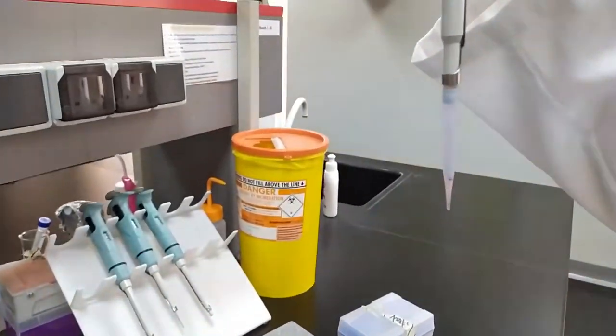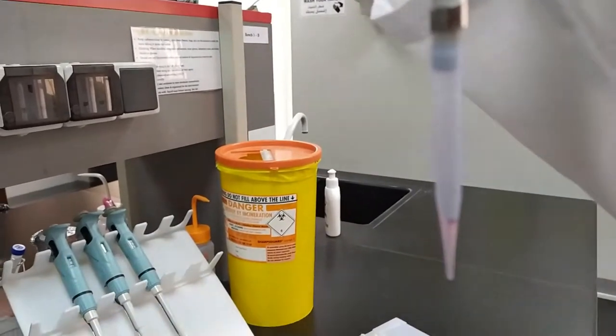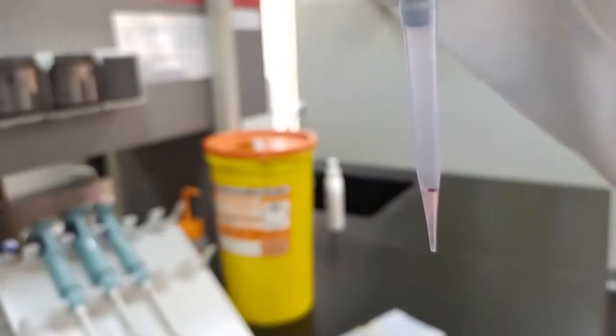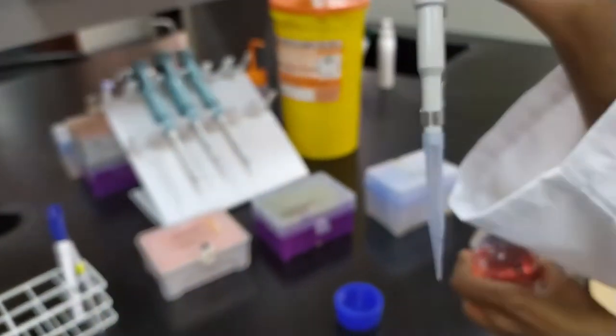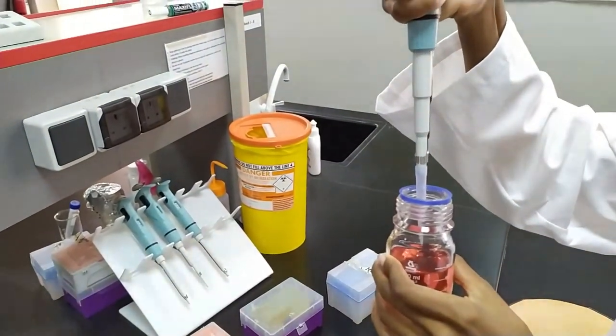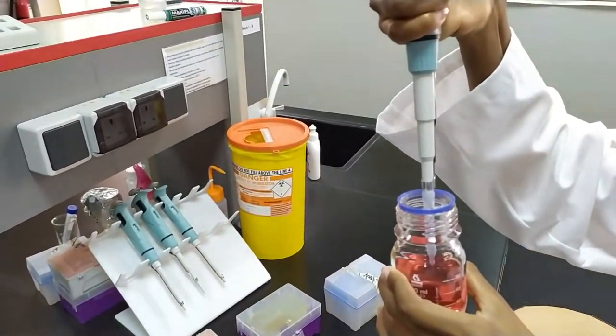Now we're using a red liquid here so we can make the solutions a little bit more clearly visible in these tips. Now that we have a marking for 100 microliters on our micropipet tip, we're going to show what it looks like when you pipette the wrong way.